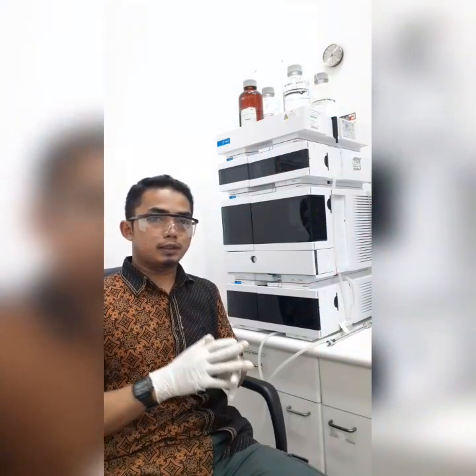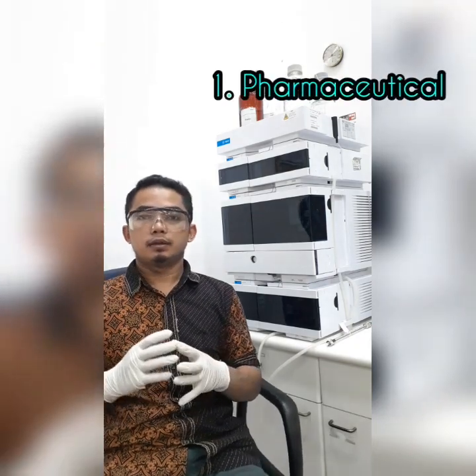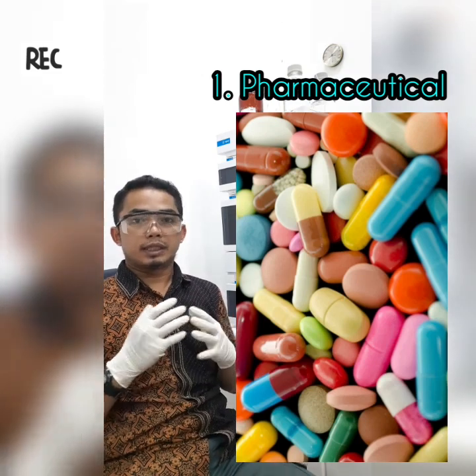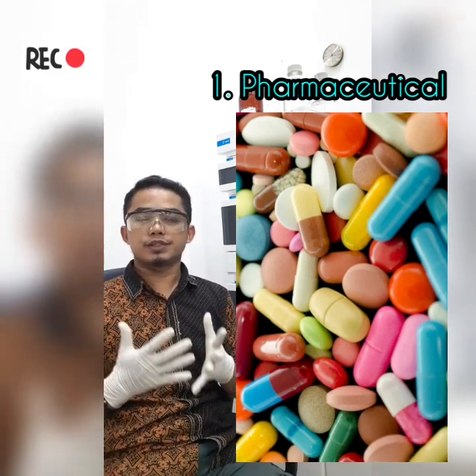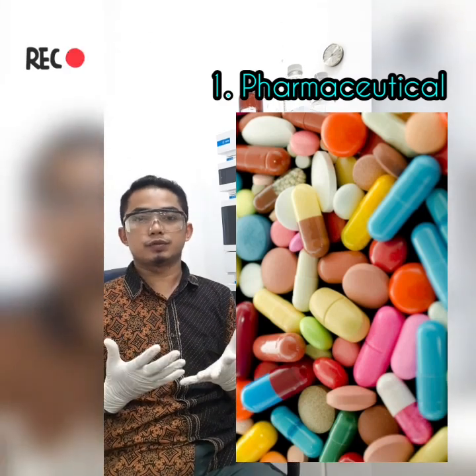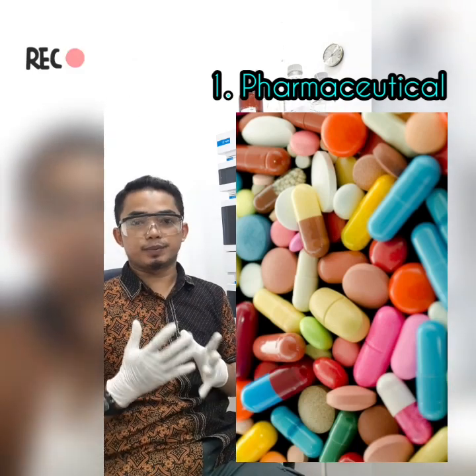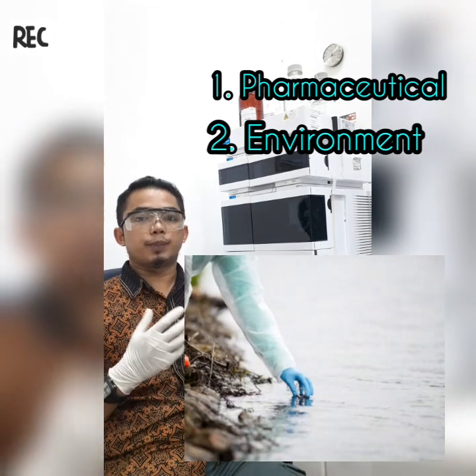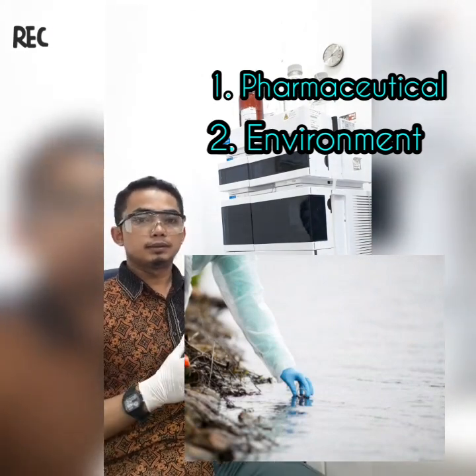Okay friends, for the other applications of HPLC, number 1 is pharmaceutical applications, including to control drug stability, tablet dissolution study of pharmaceutical dosage form, or pharmaceutical quality control in industry. Number 2, environmental applications, for detection of phenolic compound in drinking water, biomonitoring of pollutant.